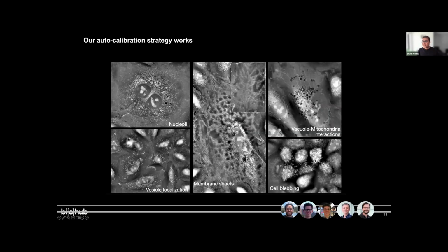And Gail, who we just heard about in Alfred's talk, has been really having a time with this data and finding very interesting phenotypes, looking through all of this data and discovering new types of responses to perturbations. It's been proving very valuable for optical pool screens.